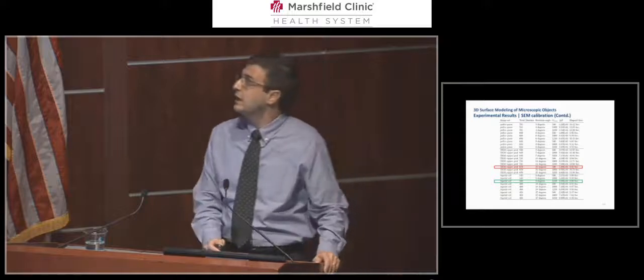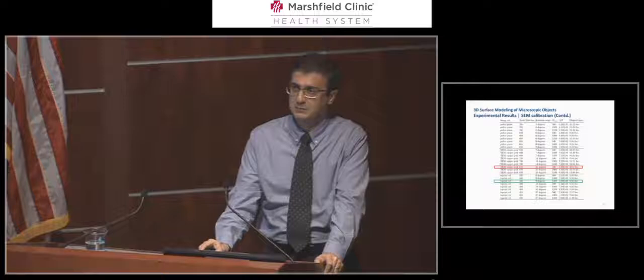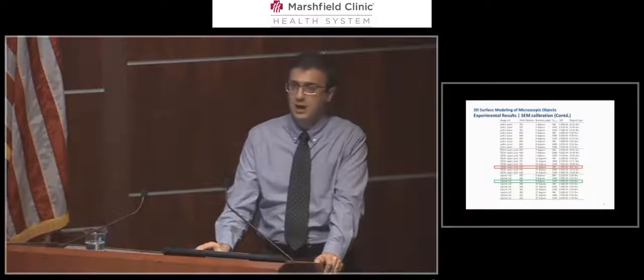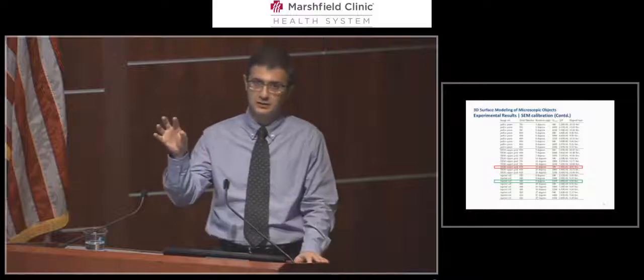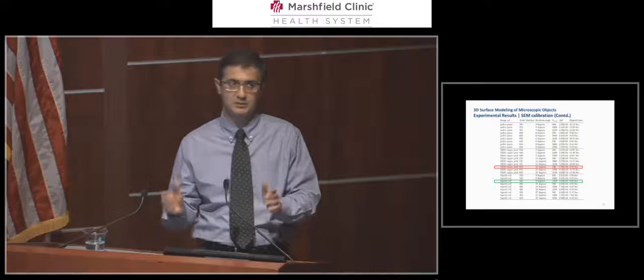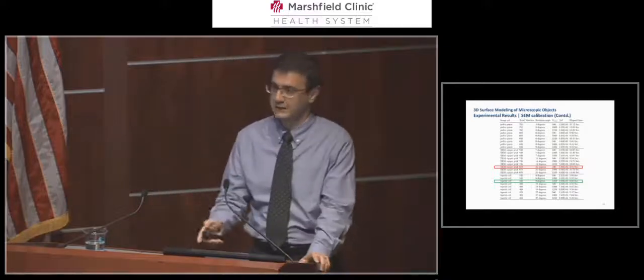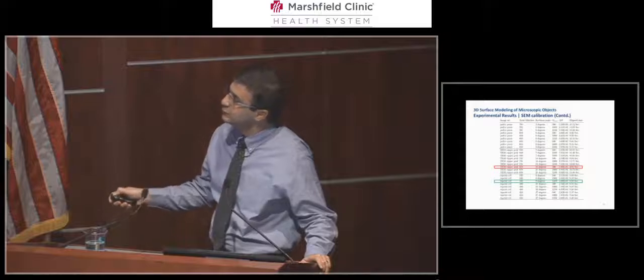Here in this slide, you will see the accuracy results in SEM calibration. As you remember, our problem had two sides. One is estimating the 3D location, and the other is estimating rotation and translation between images. We called it SEM calibration. In the first column, you see a set of different 2D SEM images.